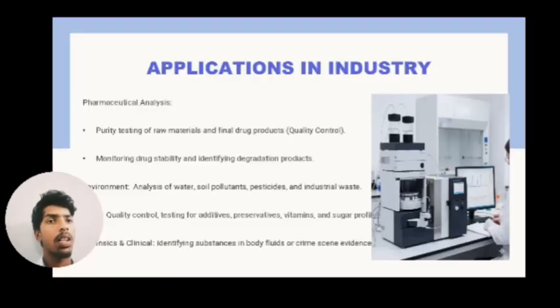Let's know applications in industries. Pharmaceutical: analysis, purity testing of raw materials and final drug products, quality control, monitoring drug stability and identifying degradation products.